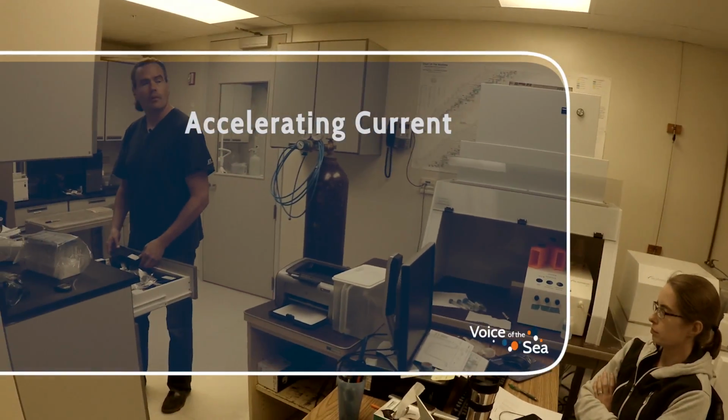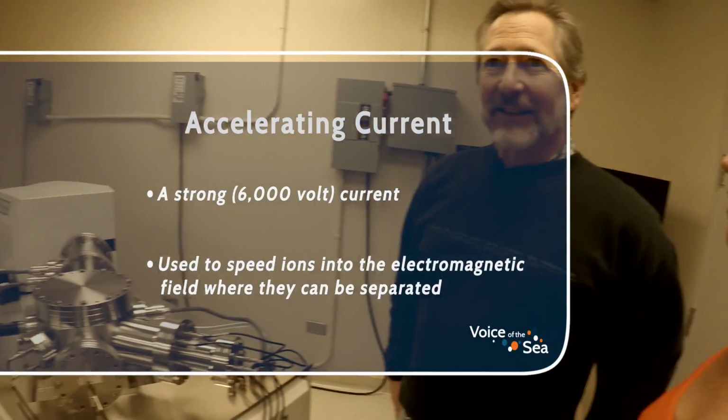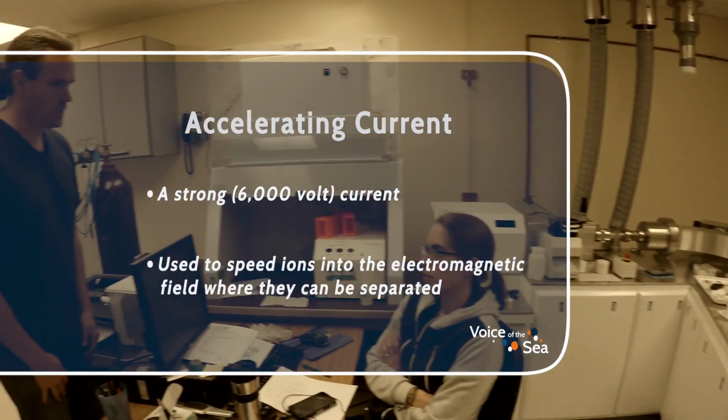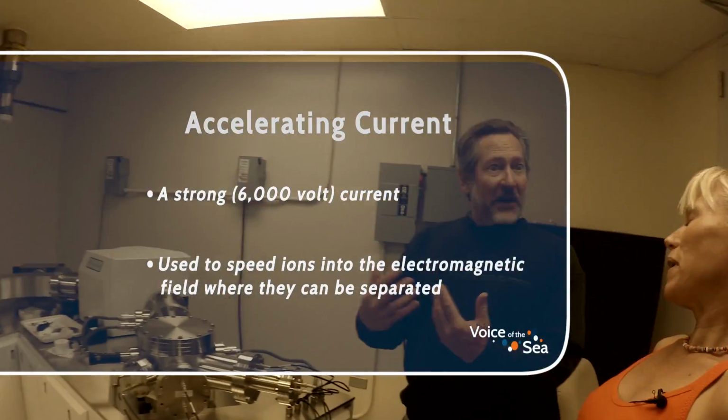Christian? Yes. What is the accelerating current to create your ion beam, to push it through your magnet? At the moment, what does V1 say, HV1? 6,000 volts. 6,000. So the accelerating voltages are about the same. We use 10,000 volts on ours. We have other instruments that only use 2,000. But the principle is the same, but the little details and the price is different.